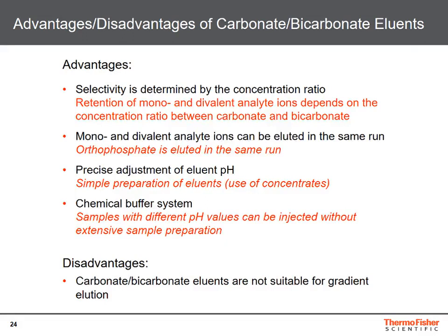Whenever we are preparing a carbonate-bicarbonate eluent, typically using eluent concentrates that are even commercially available, we automatically have a very precise adjustment of the eluent pH. I can even calculate the eluent pH with the Henderson-Hasselbalch equation if I know the 2 pK values of carbonic acid.